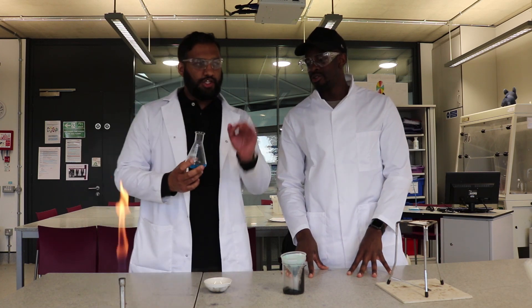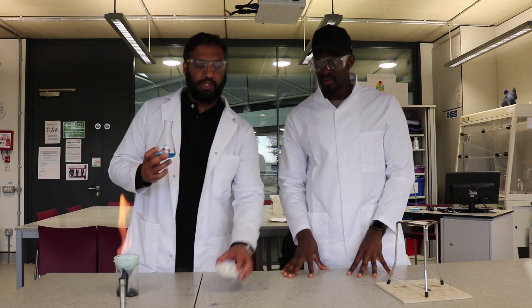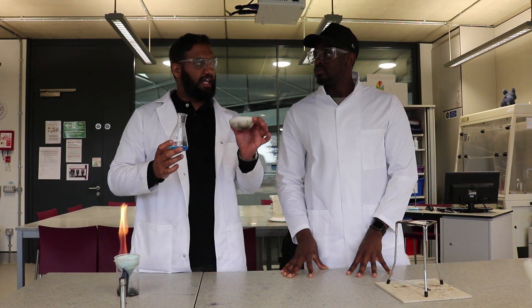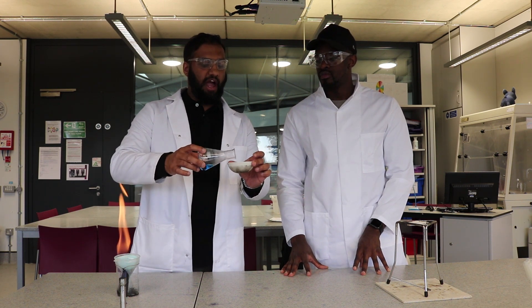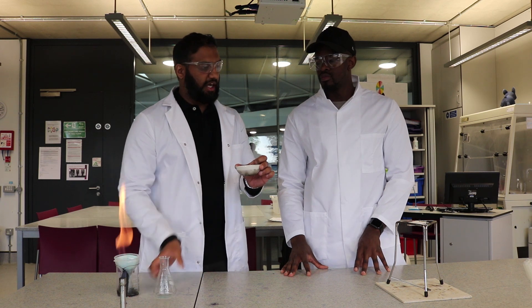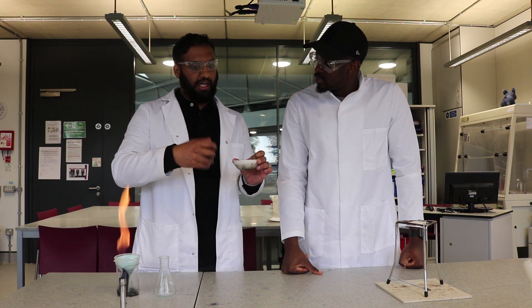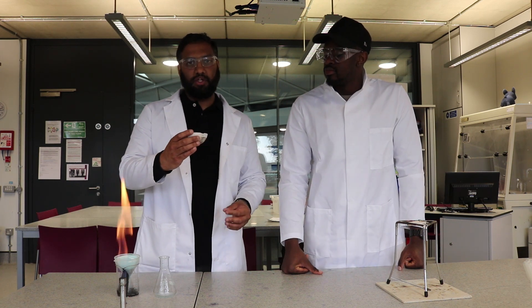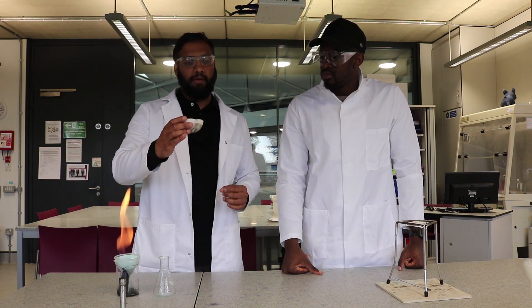The next procedure: we've mixed the mixture and filtered it. Now we're going to use an evaporating basin to evaporate the water, which should leave us with copper sulfate crystals. A couple of health and safety points: do not heat it too quickly or the salt will spit at you. If any gets on your hands, go to the tap and wash them.